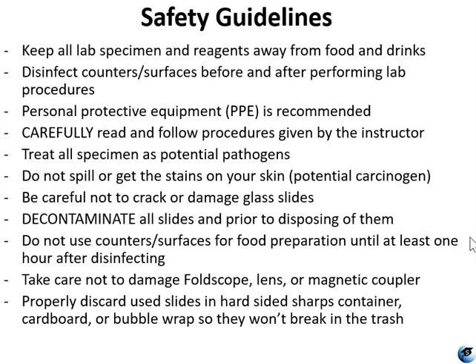You want to decontaminate your slides before you dispose of them. So we talked about this in the intro lab, but just to refresh your memory, you want to put them in a disposable container with bleach and water and let them soak for at least an hour. And make sure you're not using your counters for food preparation until at least an hour after disinfecting. Be careful with your Foldscope, the lens, the coupler. And when you're done with the slides, you want to dispose of them, again, in hard-sided containers or cardboard, or something that will keep them from breaking in the garbage.